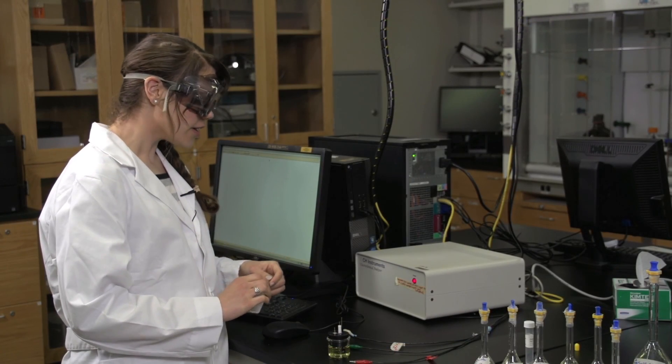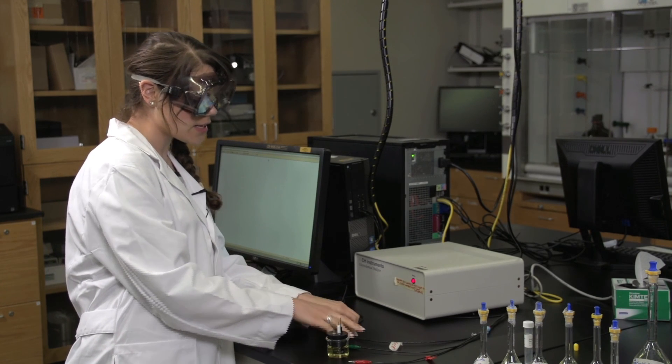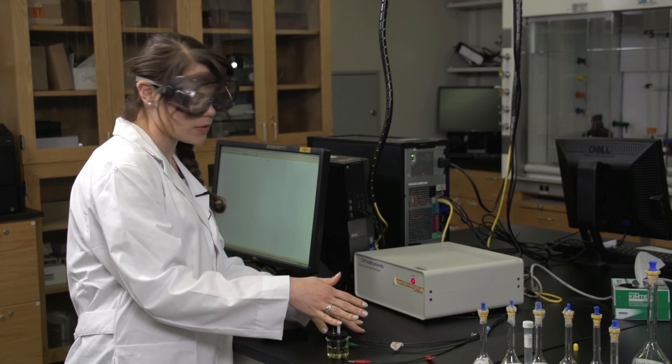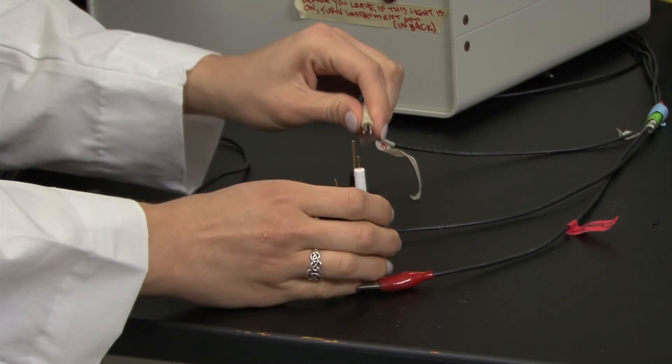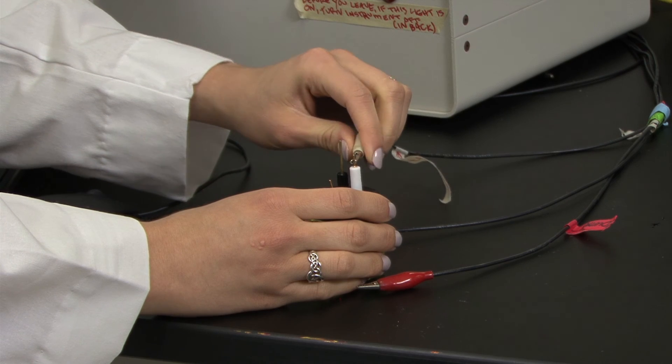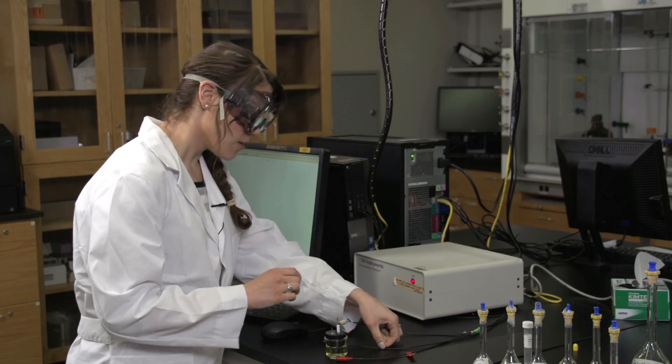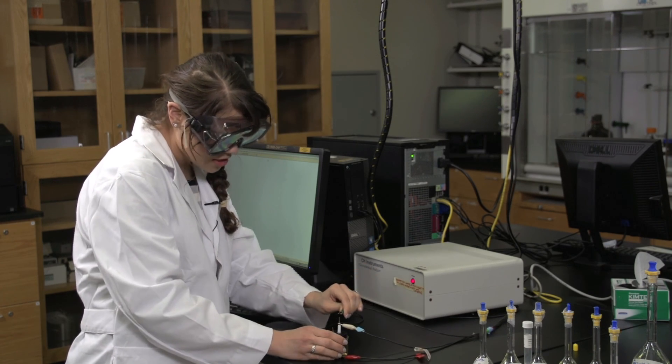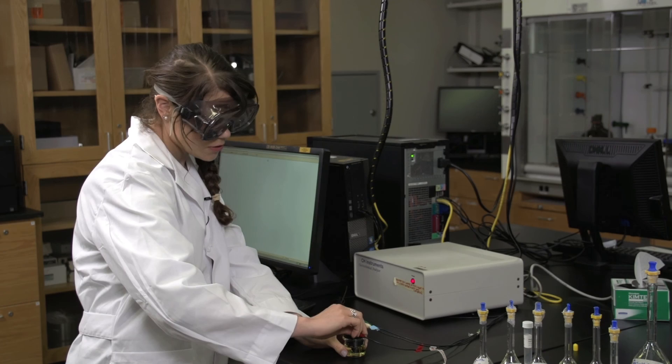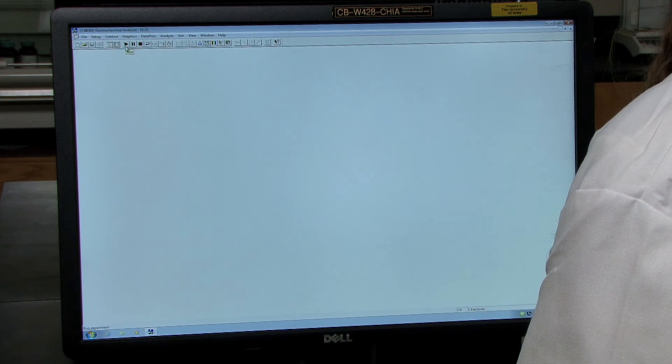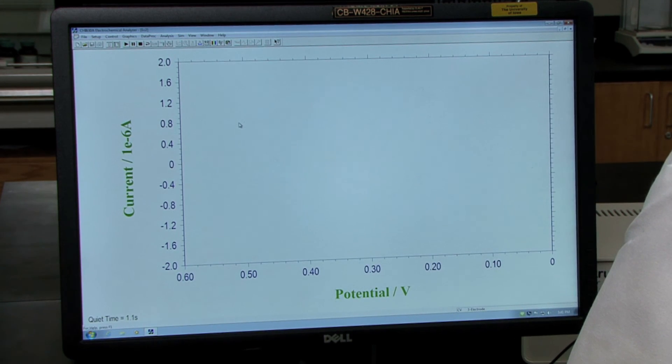Now you can connect your cell to the instrument. We have three electrodes here: reference, working, and counter. These are labeled with pieces of tape. The reference electrode attaches to the silver-silver chloride electrode. The working electrode, in this case, will be attached to the platinum working electrode. The counter electrode is attached to the platinum wire counter electrode. Once you've connected your electrodes to your cell, you're ready to collect your CV. Just hit the run icon here, the play button. As you do that, you can watch as your CV is being collected.